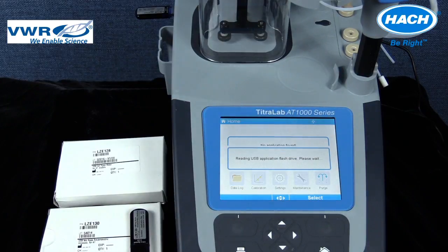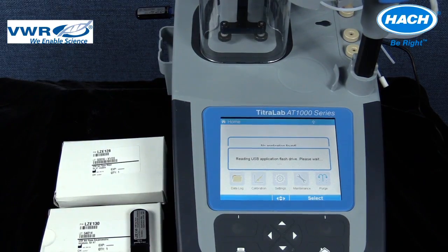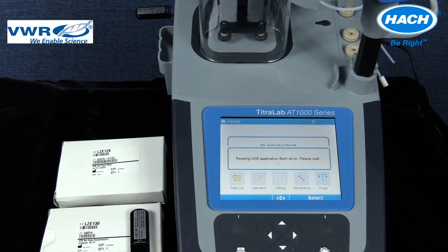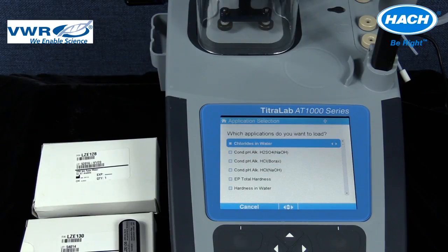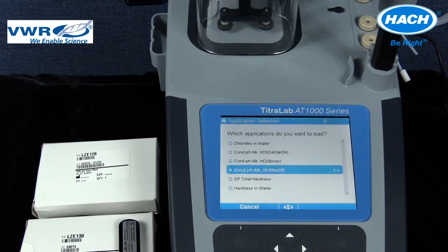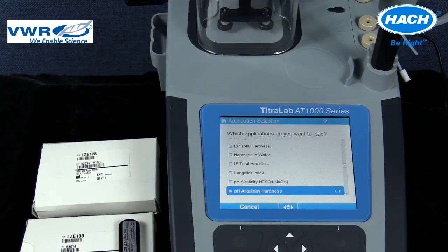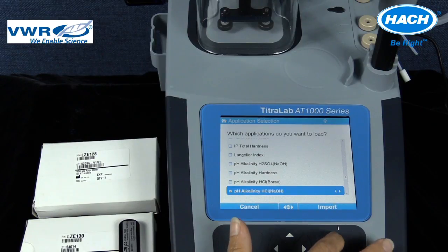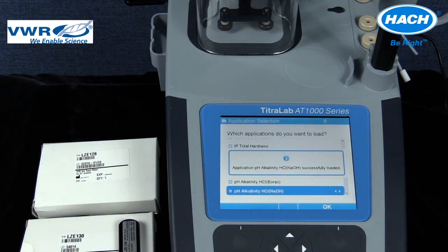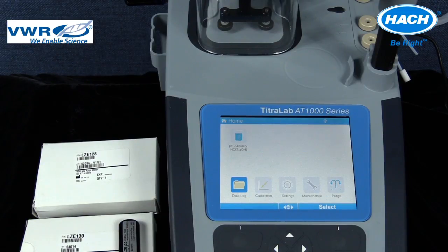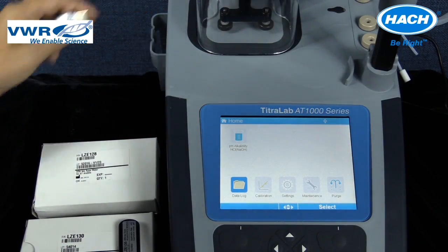In this example, the LZE128 key is going to be loaded. When the drive is first inserted, the instrument will display 'Reading USB application flash drive, please wait.' After a few seconds, the instrument will prompt to select which application should be loaded from an application list on the drive. Using the right arrow key will select the checkbox for the desired applications, and the up and down arrow keys will allow scrolling of the list. Push Import to install the selected applications. The software will then provide a statement confirming if the application or applications were successfully loaded, and then OK can be selected. The USB drive can be disconnected and used multiple times.